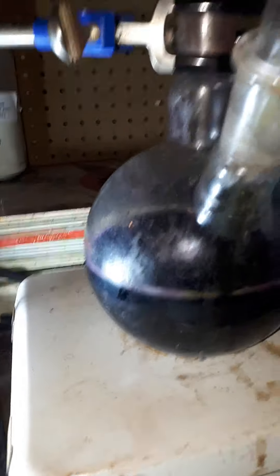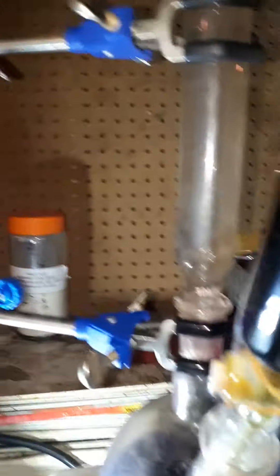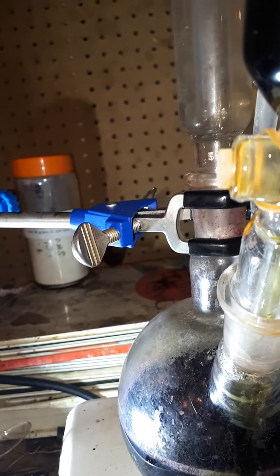This is iron ammonia citrate — 5 grams in 50 milliliters of water. I'm going to react it and try to create a pigment, and see if there are any compounds that will react to iron chloride or iron ammonia citrate. We'll see.